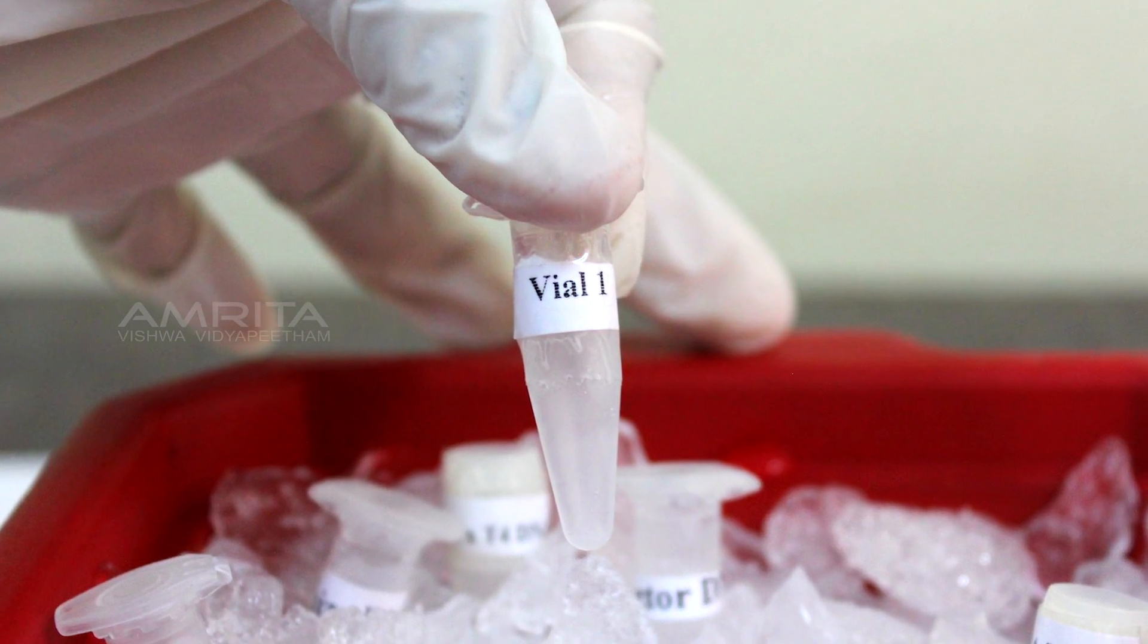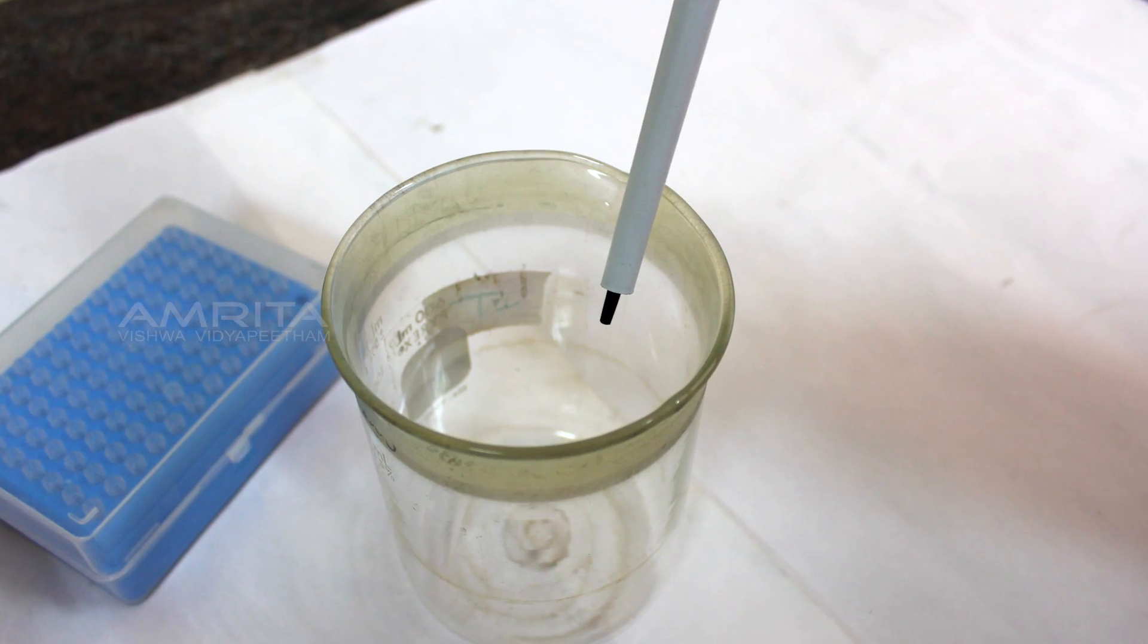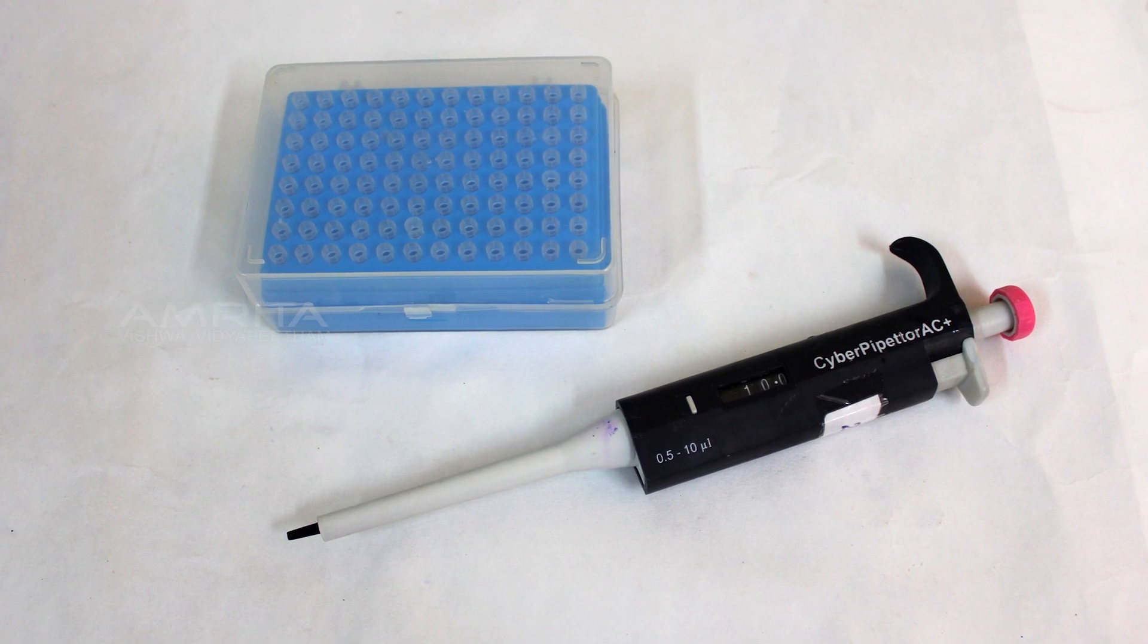empty vial labeled as vial 1, centrifuge, ice box, waste beaker, vial rack, pipette and tip box.